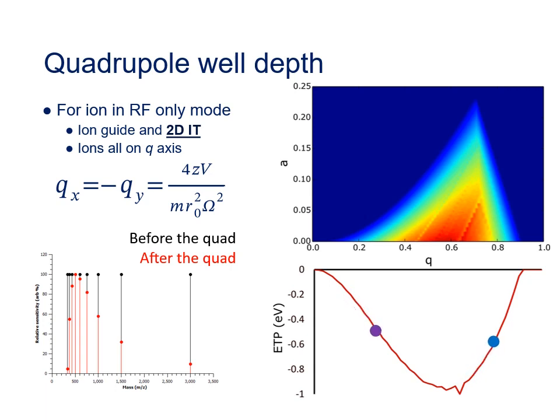But while the trapping well depth for the higher mass-to-charge ratio ion is increasing, it is decreasing for the lower mass-to-charge ratio ion, and at the boundary it drops to 0 and the ion is lost from the trap. And that should tell us that if we have an ion trapped at the bottom of the trapping well at a Q of 0.6, there's a relatively limited range of mass-to-charge ratios lighter than this ion that we can trap in that ion trap.